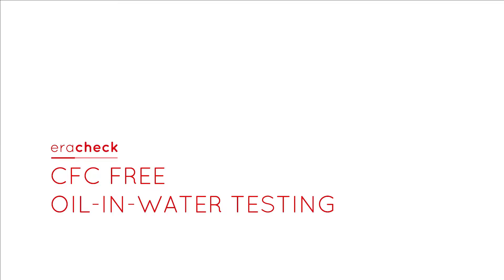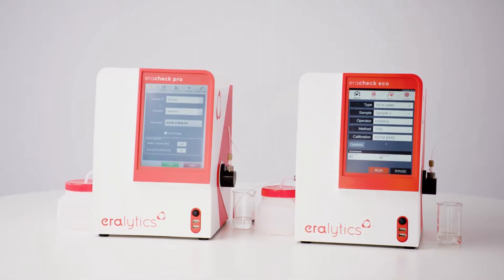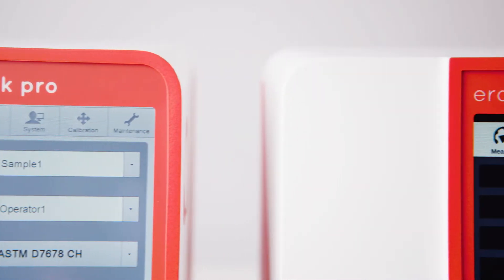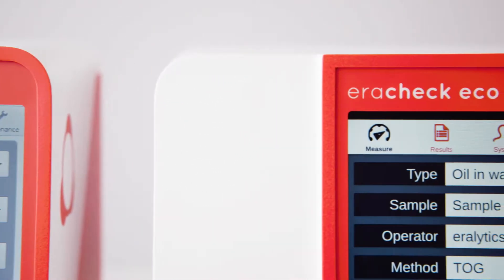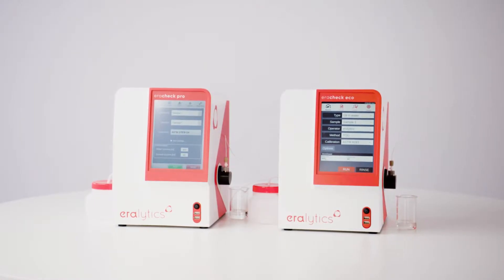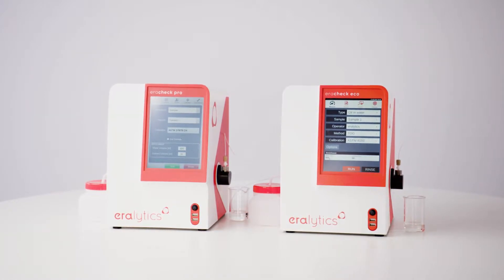eracheck – CFC-Free Oil-in-Water Testing. eracheck easily measures sub-PPM concentrations of oil in water using the CFC-free solvent cyclohexane for sample extraction. After extraction, the instrument determines the oil concentration by an IR measurement of the extract.